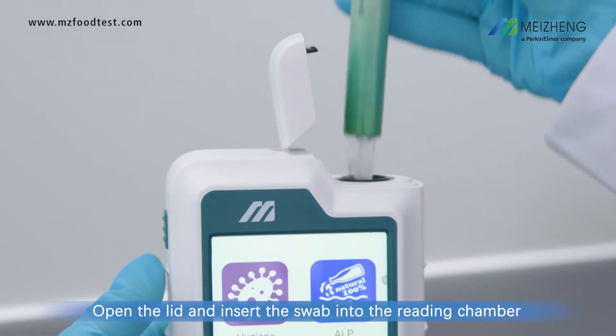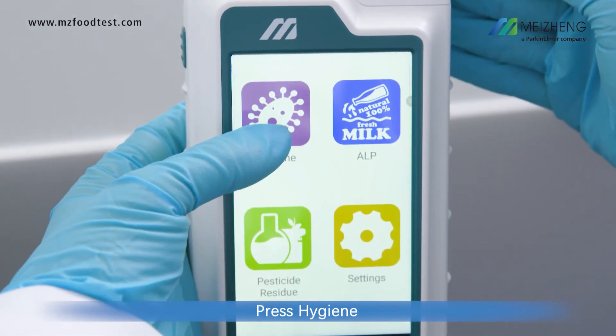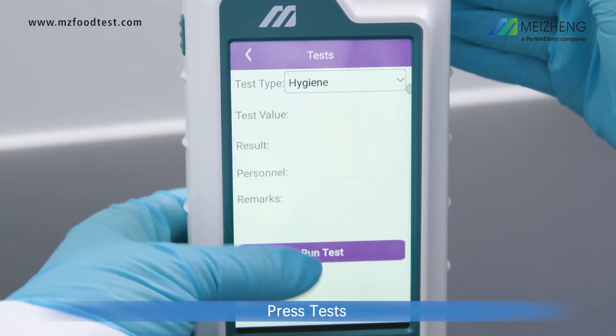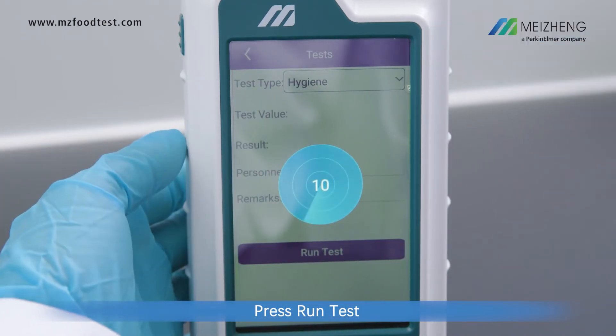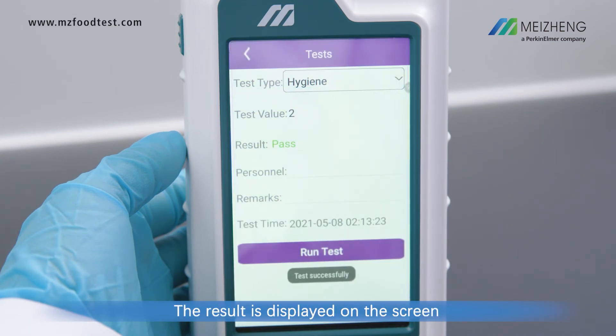Open the lid and insert the swab into the reading chamber. Press Hygiene, press Tests, press Run Test. The result is displayed on the screen.